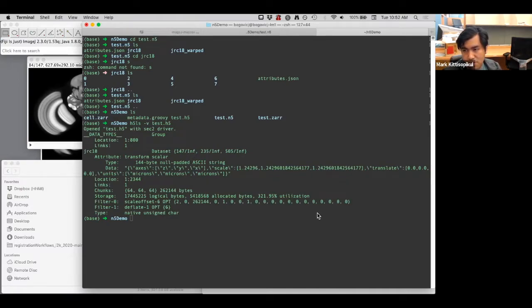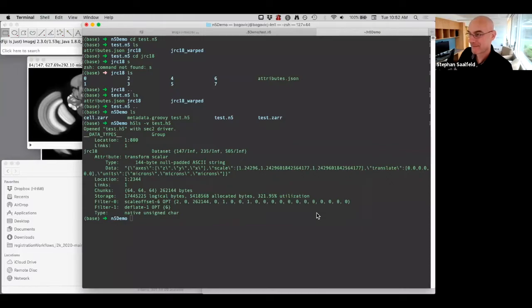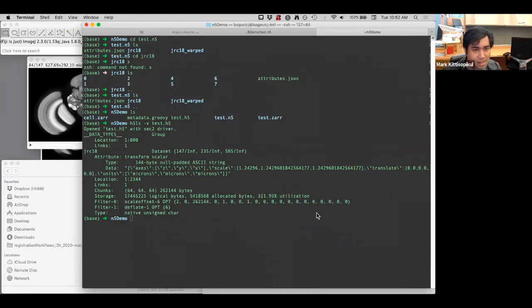We could use protobuf. It's pretty cool. Yeah, I think BSON does at least mention protobuf as well. I think protobuf is a Google technology. It's open source, is that right?